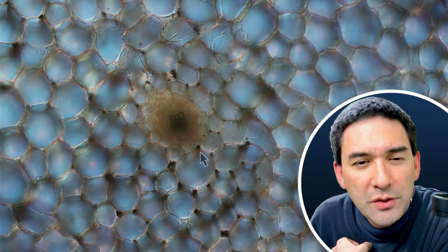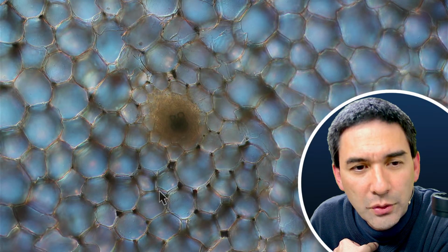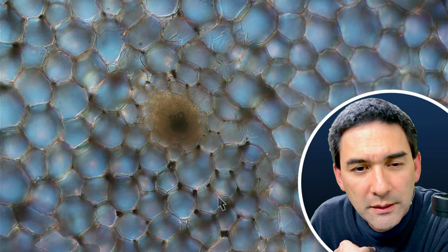So what you see over here, those little round circles, these are the individual cells, of course. And the outside of the cell, this is the cell wall. Plant cells have a cell wall, of course.